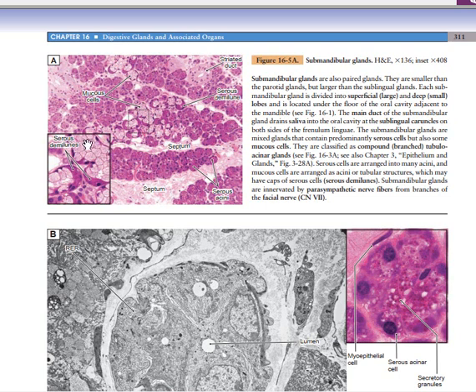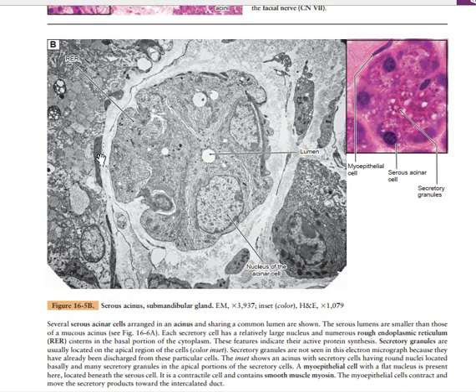and the nuclei of the mucous cells are at the base, basically. While this is the demilune consisting of the columnar cells, the serous cells. Is it clear? So the serous cells, as I have said, have granules which are going to stain purple or pinkish. So they are going to stain with hematoxylin and eosin stain. And the mucous gland has no stain, so the stain is going to be lesser. That's why it has a greater and clear center.